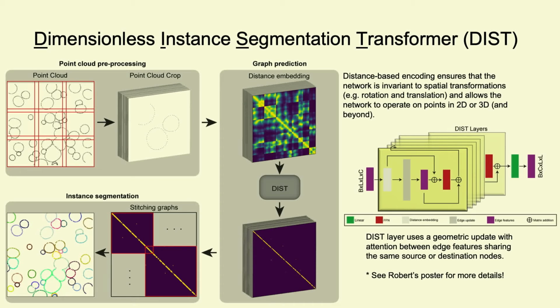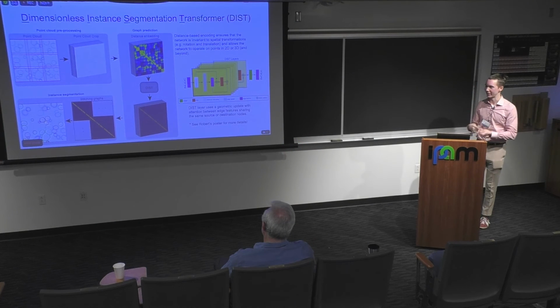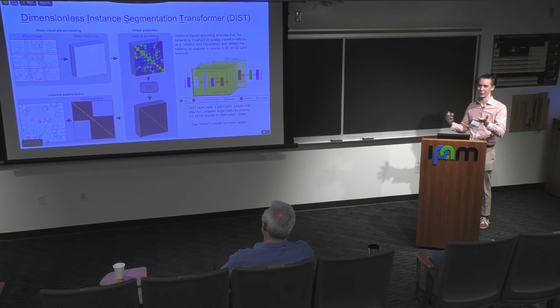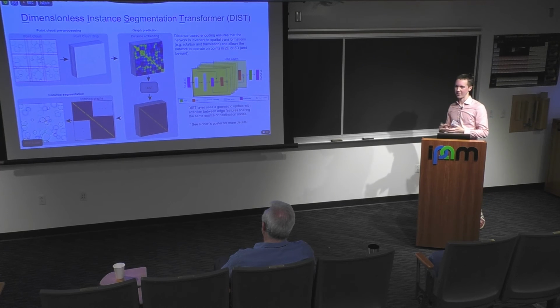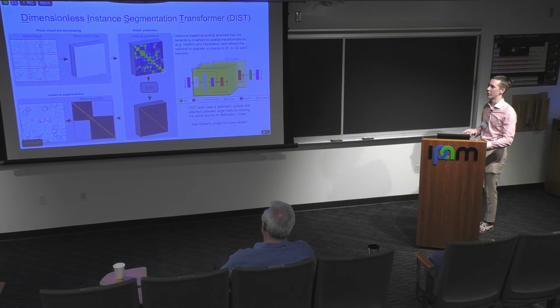Then we're going to take this distance matrix and process it through a neural network that is very similar to AlphaFold, where you have this pair representation. We're going to do attention-based updates on this pair representation, with a network inspired by the triangle inequality, to preserve the fact that distances should obey that, so the representations between points update in that way.